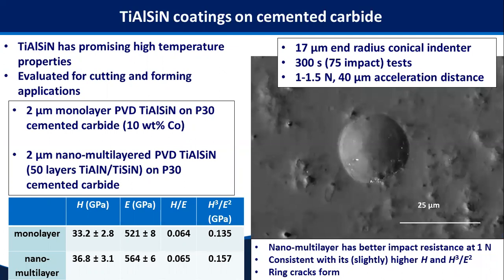So it's resistant to lateral fracture. So we do 75 impact tests, and you can see there's no lateral fracture at 1 Newton, and a little tiny bit of ring cracking, but nothing too severe.